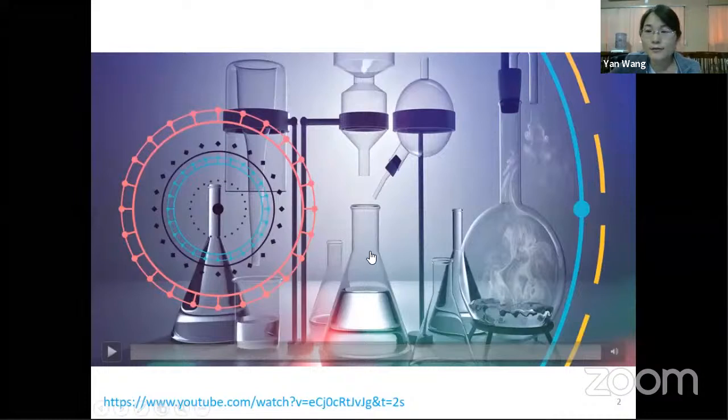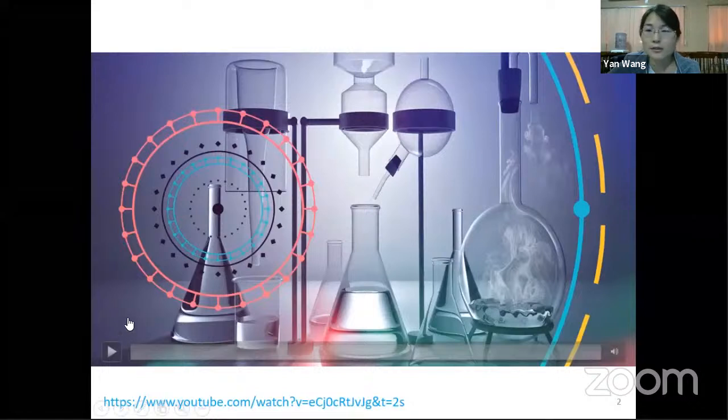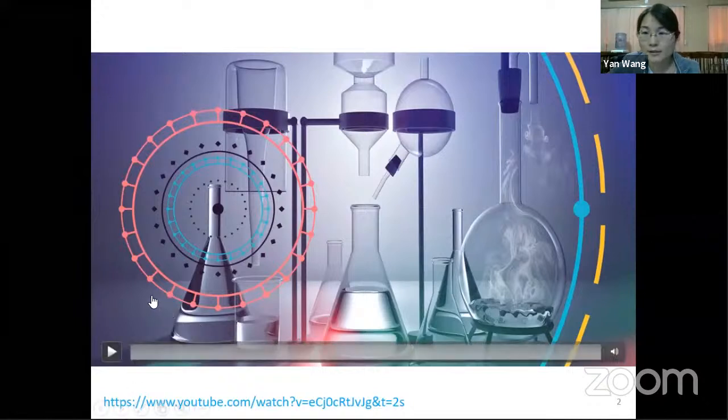Through this video, you can have a rough idea about the whole process of analytical HPLC. Then we are going to start with what preparative HPLC is and what the difference between these two is.